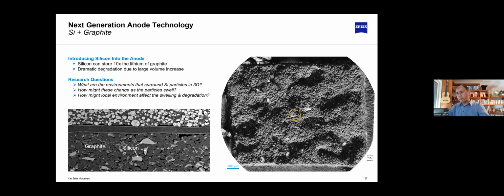As part of that investigation, imagine we would like to locate a TEM lamella at the right place of the anode, which contains silicon particles. Finding it is a challenge because we cannot just judge from the surface. So that's why we take the sample to the Versa and perform the Versa scan.